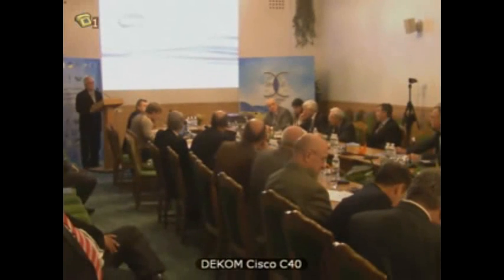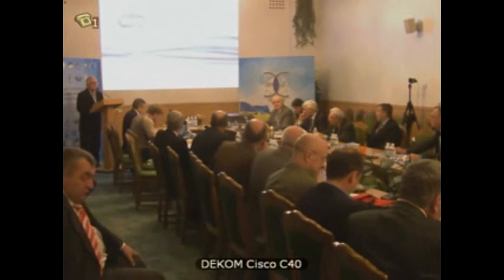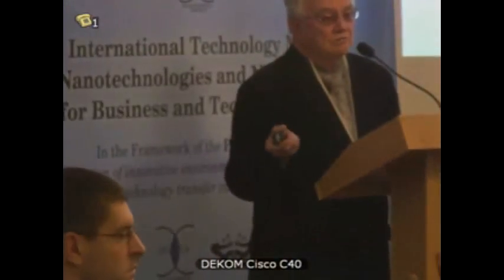Thank you, Doctor. I think there will be many questions. Okay, is it for X-ray structure or X-ray phase analysis? If it's a thin structure, it's for both the structure and for phase analysis. Of course, it's a huge potential scope of use. You mentioned electrothermal heating. Is it inductional heating? Or no, by current of industrial frequency. So direct contact, yes.